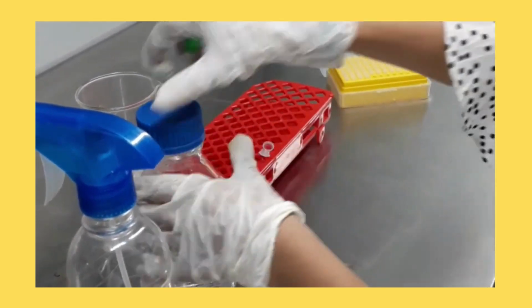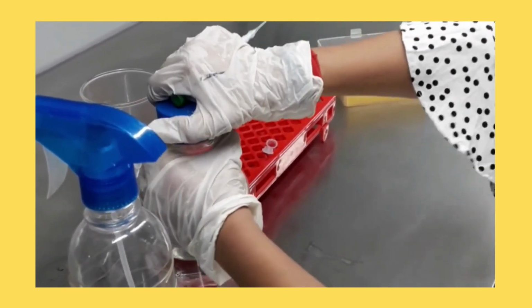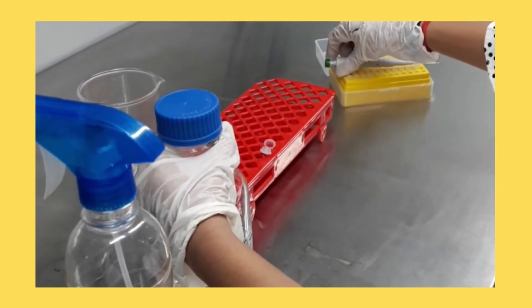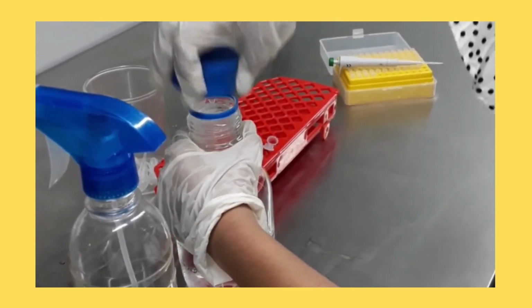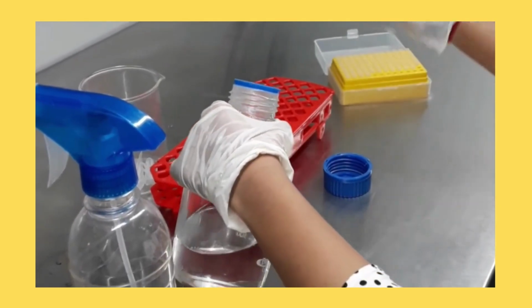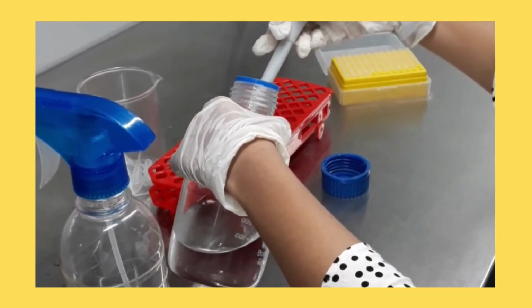Resuspend the pellet in DEPC treated water as per the sample amount. If the pellet size is small, we add 10 microliters. If the pellet size is more, then we add 15 microliters of DEPC water.